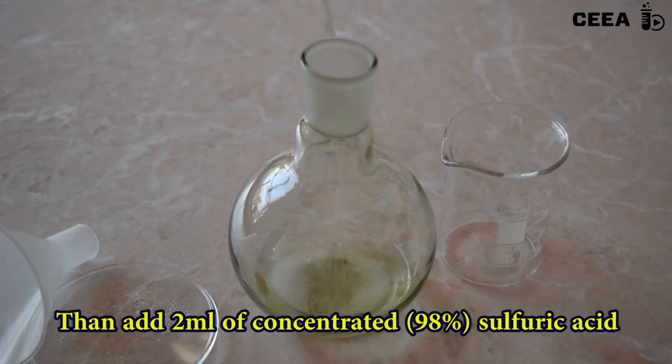Add to the mixture 2 ml of concentrated sulfuric acid.